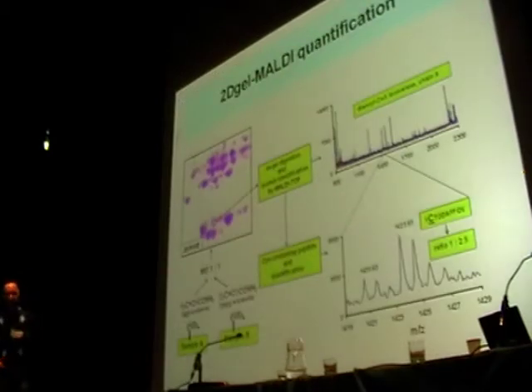That's a major slide, and I'll spend the majority of my time on this slide. Let's explain the workflow procedure for how to do relative quantification of literally dozens, maybe hundreds of proteins between two samples. We call them sample A and sample B.